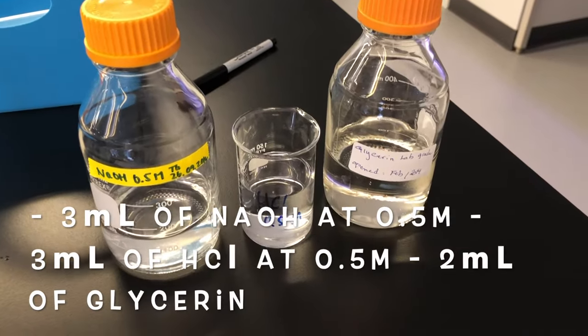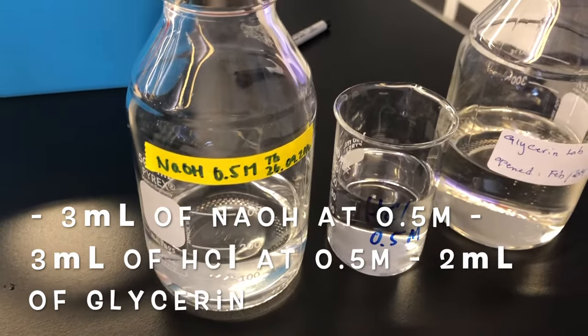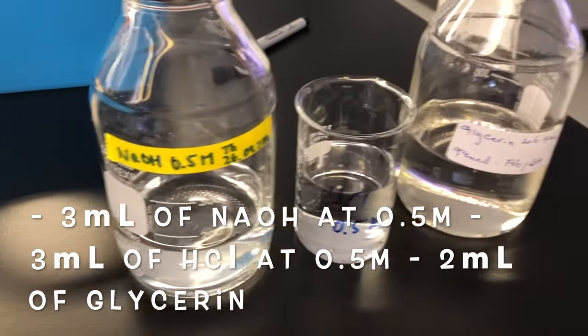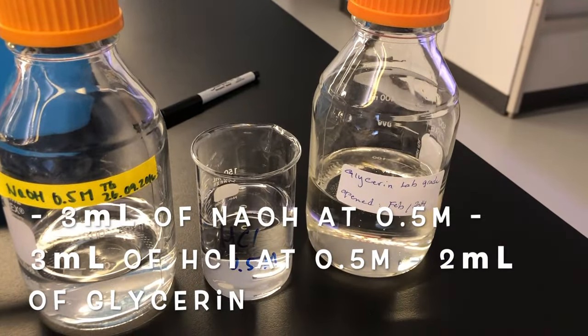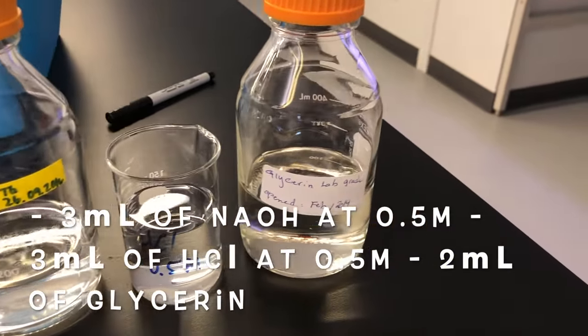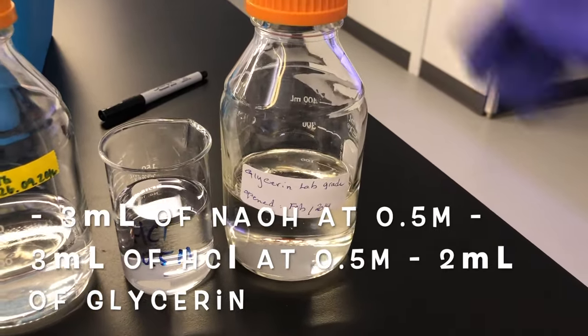As for the reagents, we have NaOH at 0.5 molar concentration. We also have HCl at 0.5 molar concentration, and also glycerine which will be our plasticizer.